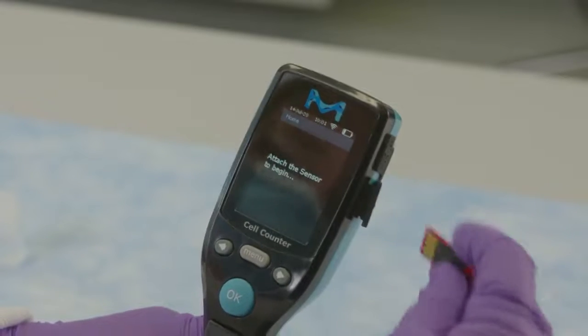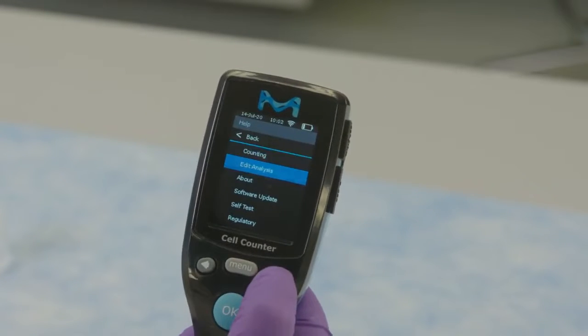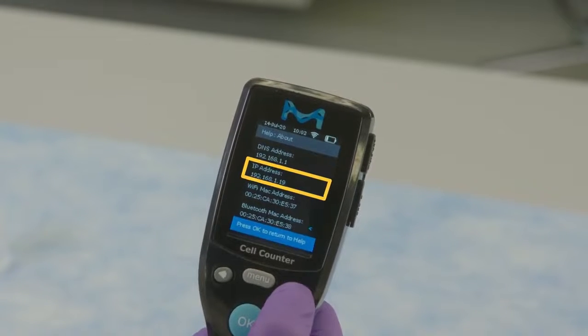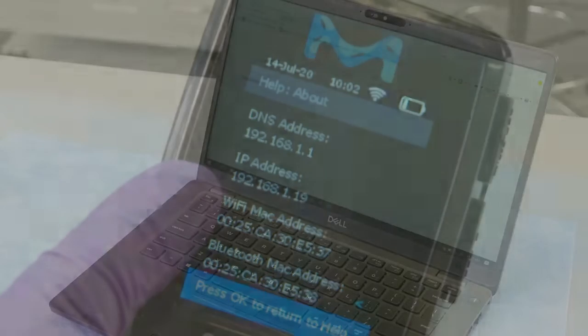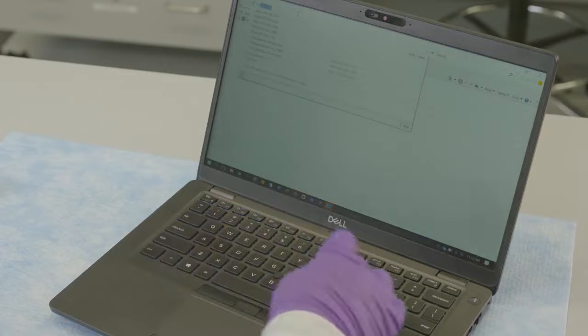Obtain the SEPTOR 3.0 IP address. From the main menu, select help, about, and scroll to find numbers. In our case, it's 192.168.1.19. Confirm the SEPTOR 3.0 is connected to the same Wi-Fi network as the computer.